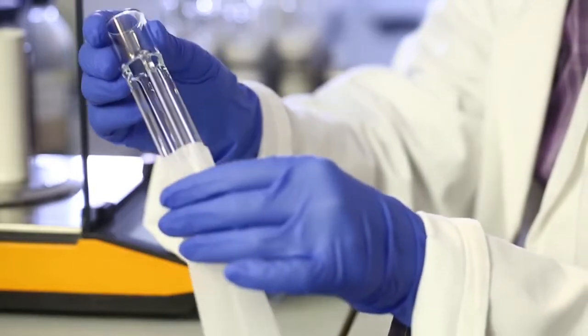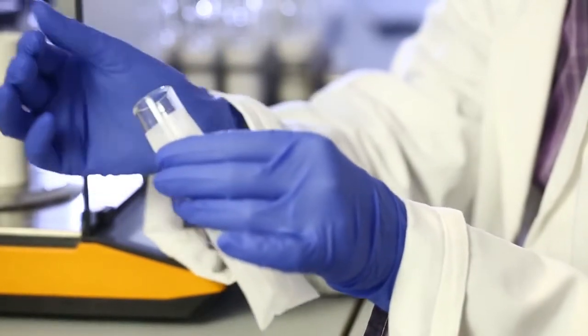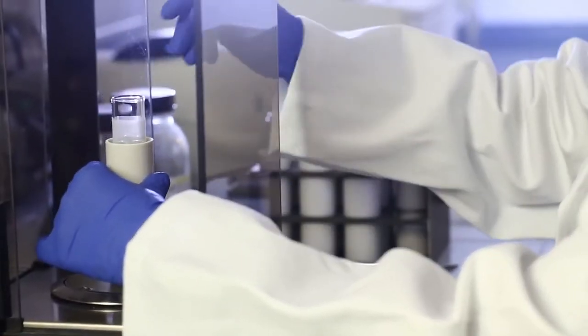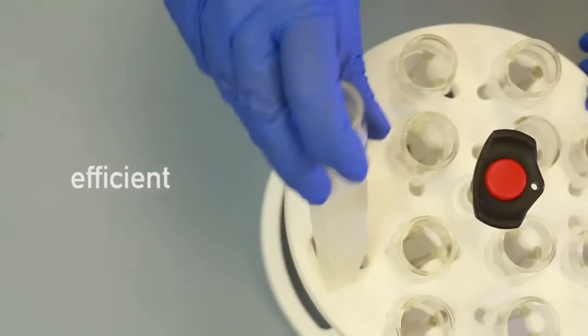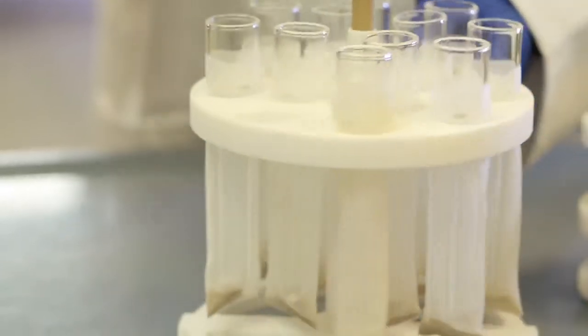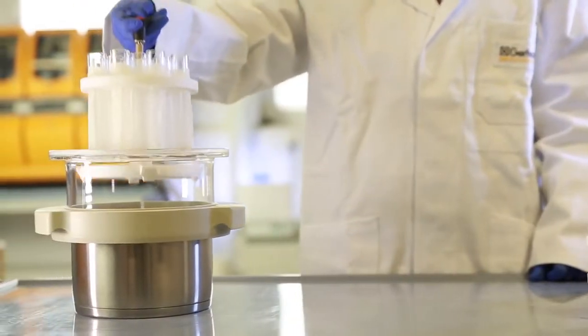The glass spacer ensures that the sample is optimally wetted and bathed at all times. The fiber-backed system allows several samples to be analyzed at the same time. Two systems are available for this purpose.